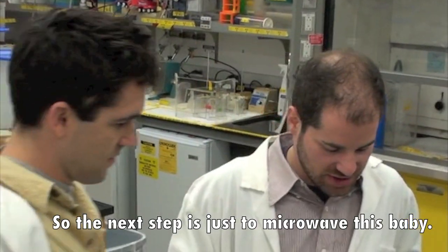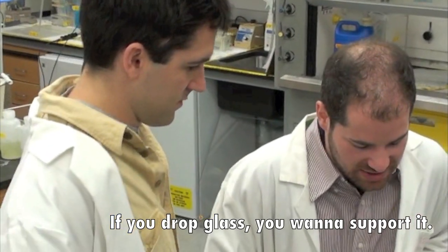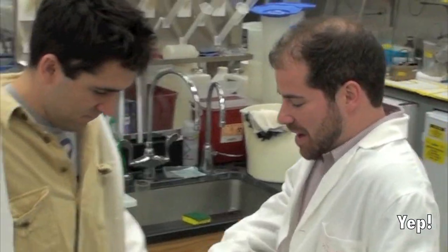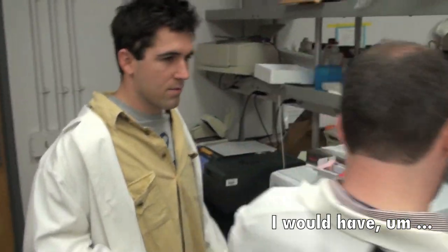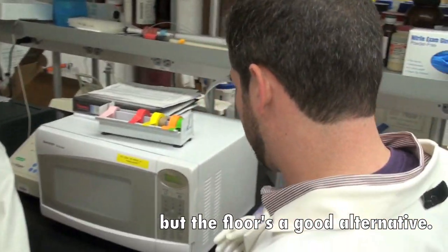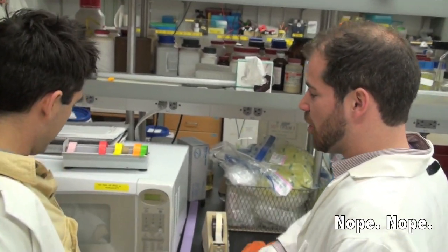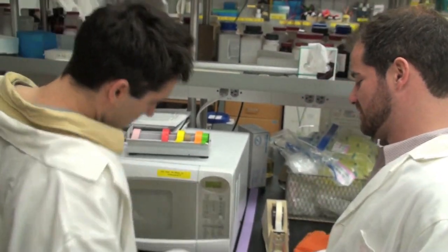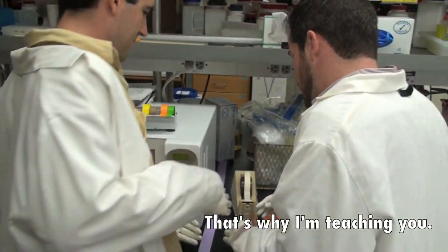So the next step is just to microwave this baby. All right, this is glass. You know, if you drop glass, you want to support it. Here. All right, let's walk it over to the microwave. Yep. Set that bucket down. I would have put it on the counter, but the floor is a good alternative. So just, there's the button to turn on. Nope, you don't lift it. You just press that button. What button? Yep. Oh, I didn't know that's a button. Okay. Yep, that's why I'm teaching you.